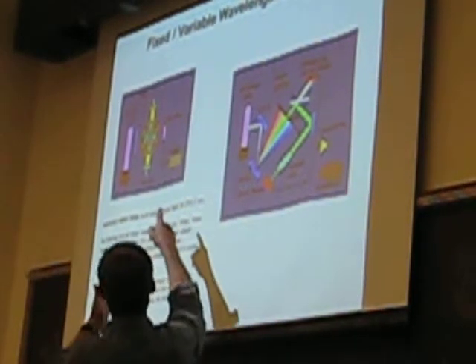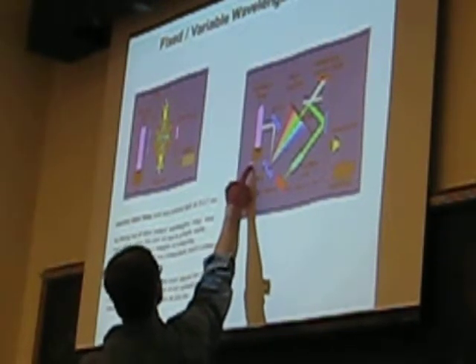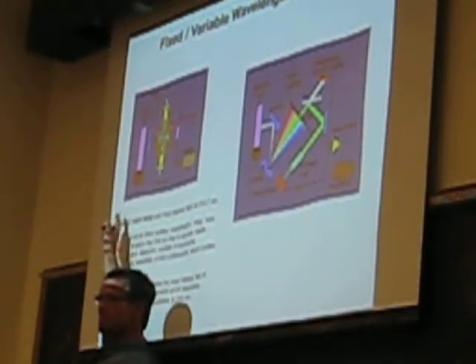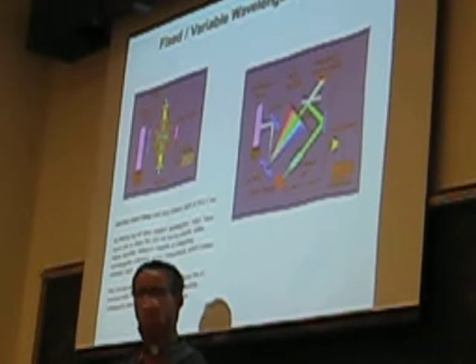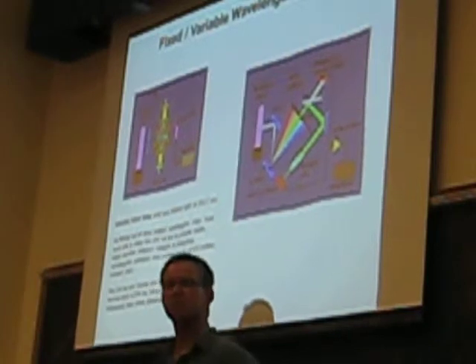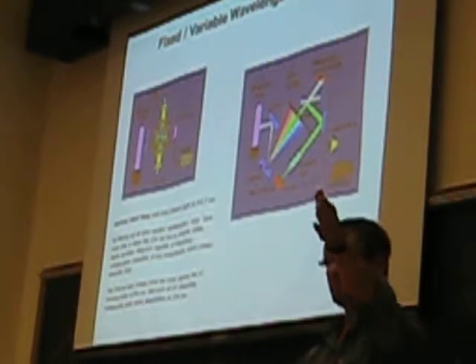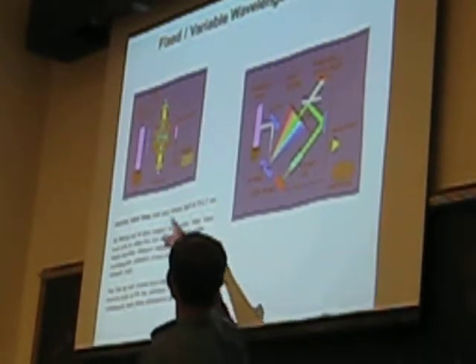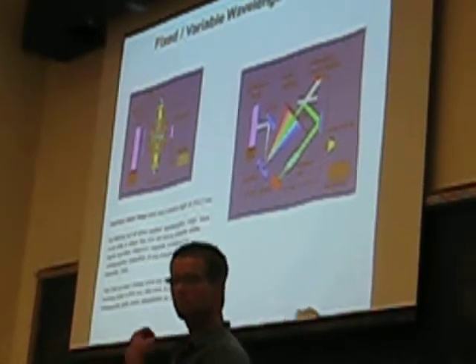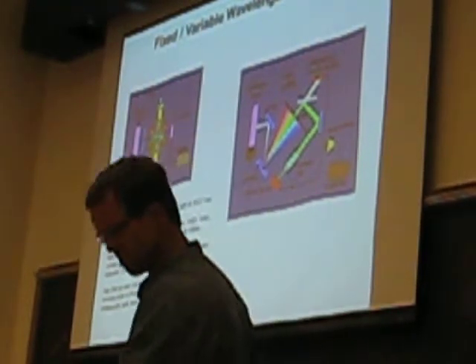In the simpler fixed wavelength detectors for liquid chromatography, rather than a deuterium arc lamp that generates polychromatic light that's then selected, they oftentimes will use a mercury lamp, with mercury vapor inside that lamp that, when it's ionized, generates an intense line at about 254 nanometers, and that's the only wavelength of light it's capable of emitting. So this is only good for measuring things in biological samples, because aromatic rings on amino acid side chains absorb pretty strongly at 254 nanometers. So that's how they achieve that.